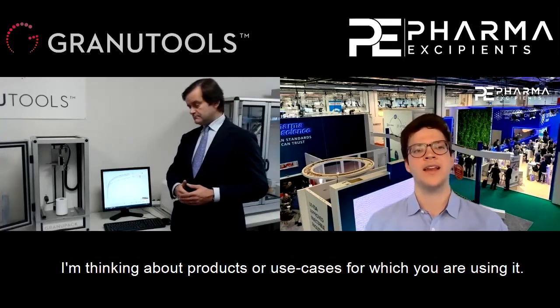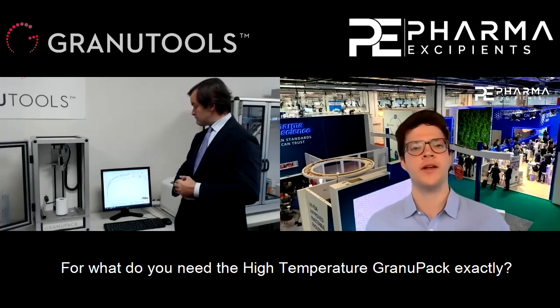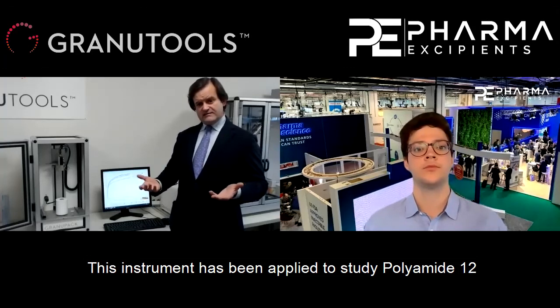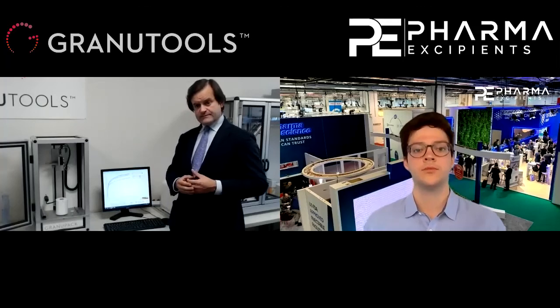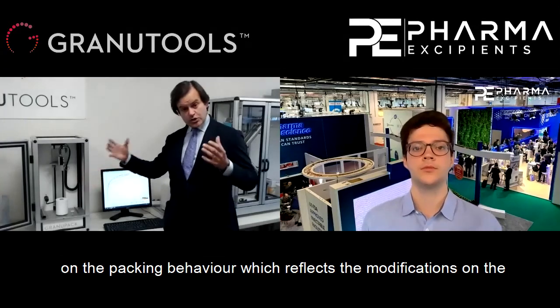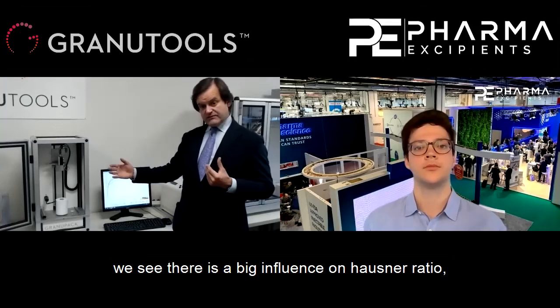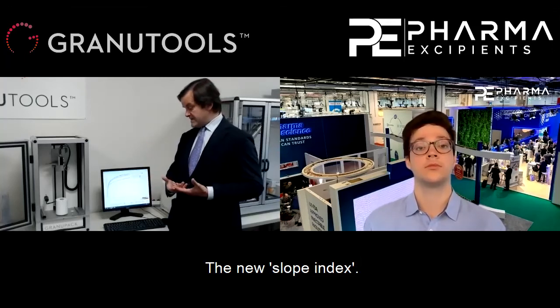Okay. And I'm thinking about products or use cases for which you are using it. For what do you need the high-temperature GranuPack exactly? So this instrument has been applied to study polyamide 12 and TPUs, which are used tremendously in additive manufacturing of plastics. The results showed a huge influence of the temperature on the packing behavior, which reflects the modifications on the microscopic properties of the powders. Even far below the melting temperature, we see that there is a big influence on Hausner ratio, characteristic tap number and half. And we also designed a new index, the slope index.